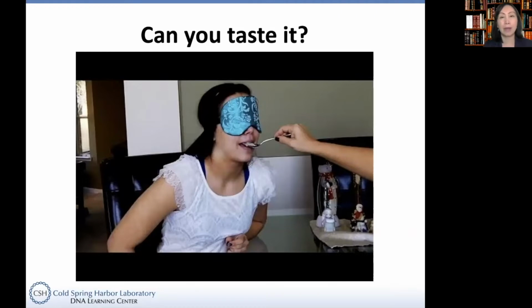Actually, it's pretty easy. I'm going to show you how. Here, I have 2 bottles of testing paper I got from Carolina. I have the link posted on the website, so if you're interested in purchasing, you can use that as a reference. I bought 2. One is called control paper. The other one is called PTC test paper. When you open it up, it has a lot of paper you can use, and you just need to get 1 piece for each person, like this.